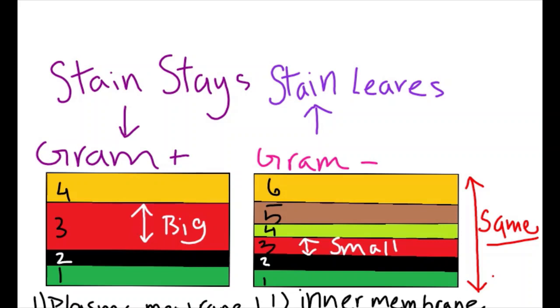or pink. The gram stain itself leaves a purple color and will stick to the thick peptidoglycan layer of a gram-positive bacteria, but will wash right off the gram-negative's thin peptidoglycan layer. Later, the gram-negative bacteria will be counterstained by safranin, which helps get its pink color.